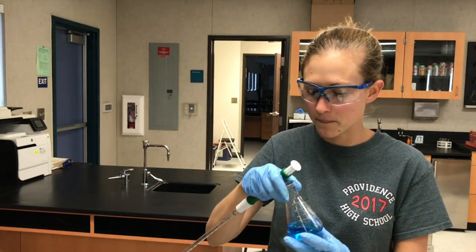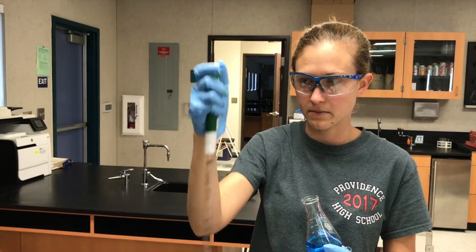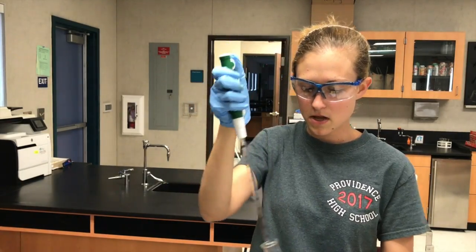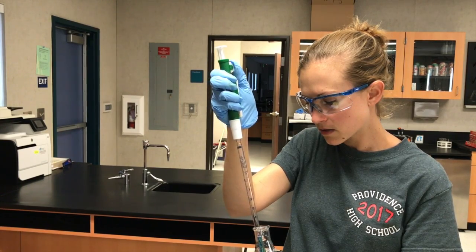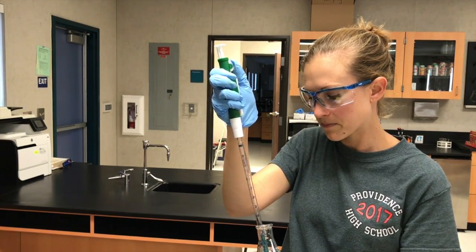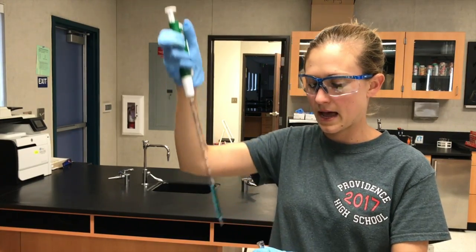Now I want to measure 4 mils of my copper nitrate as well. So I'm going to take it, same technique. I'm going to make sure this is all the way down so I can pull up the solution. I'm going to scroll up to 4 mils. Okay. And then I'm going to add it to my cuvette.